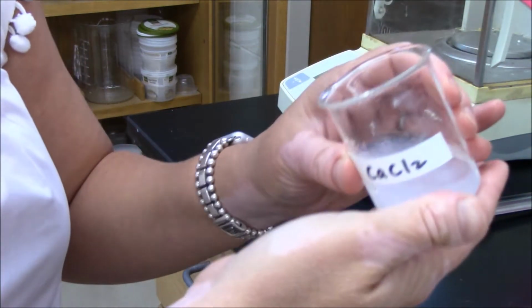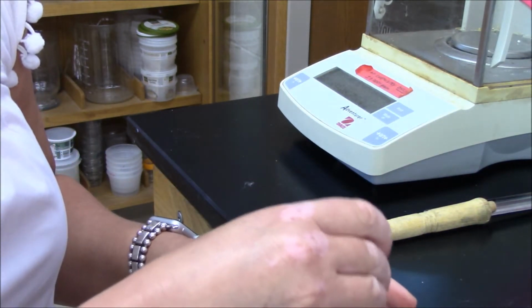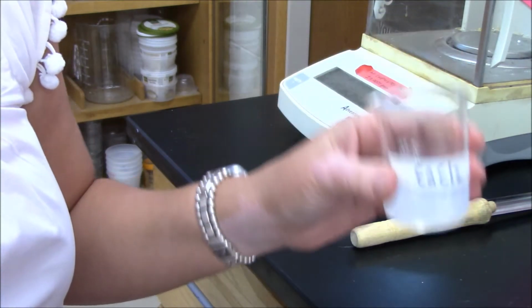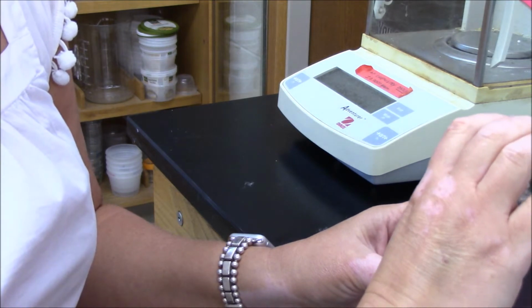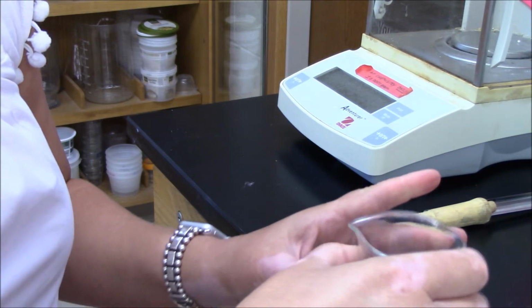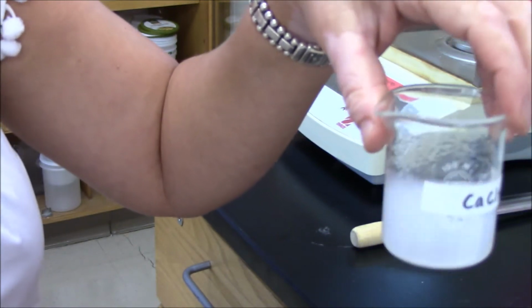Okay. It's hard to see, but this is warm to the touch, most likely because the calcium chloride solution was warm. The dissolving process is exothermic. But this solid is kind of gel-like. All right, stirring and observing.